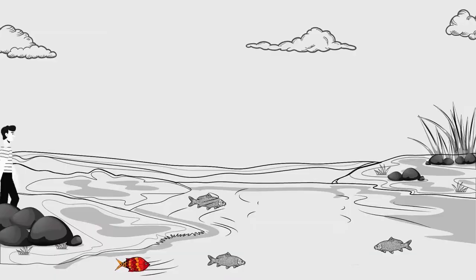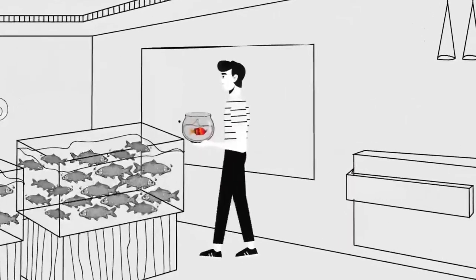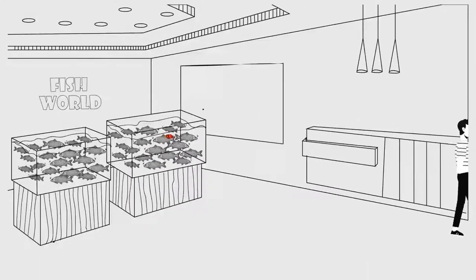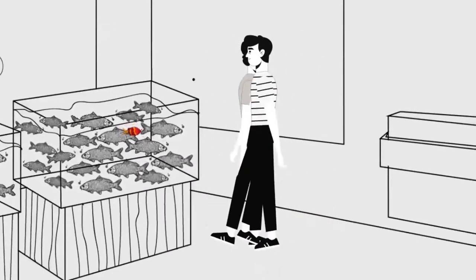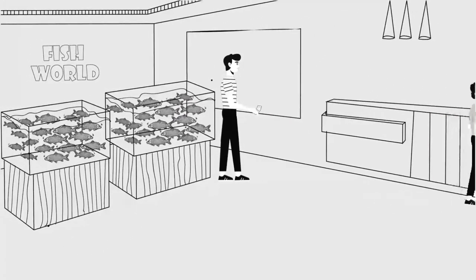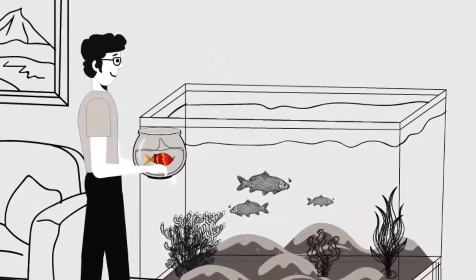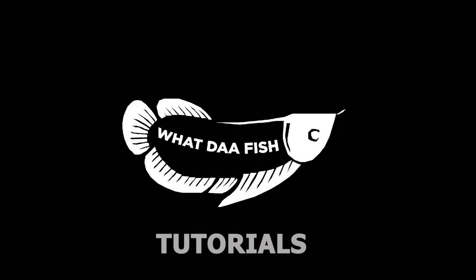Hello and welcome to another tutorial from What the Fish. Today we will talk about pH, which is the power of hydrogen and which is very important in this hobby. We will calibrate a digital pH meter and use it so that you can use pH sensitive fish.